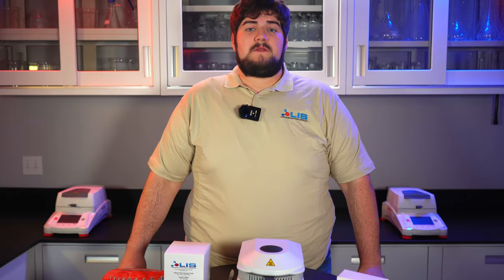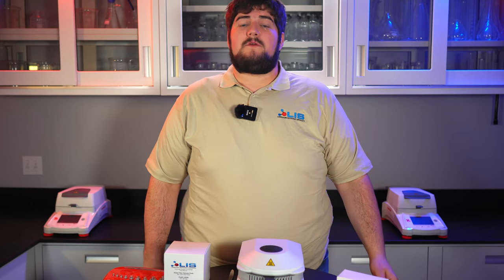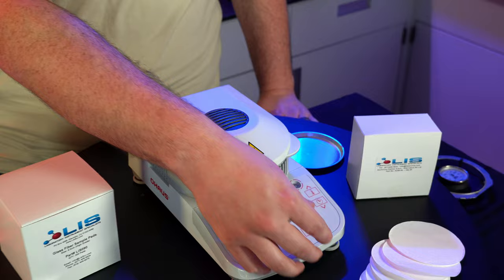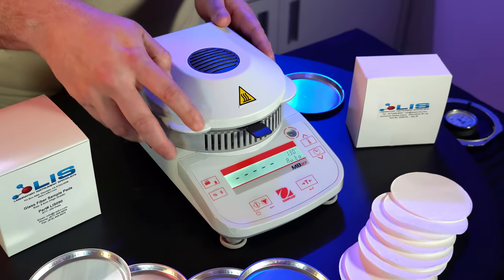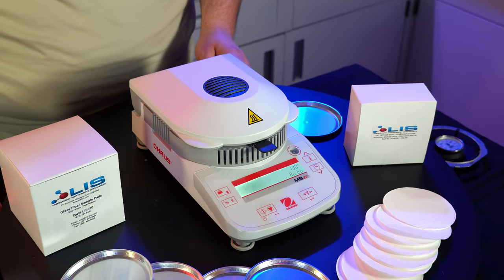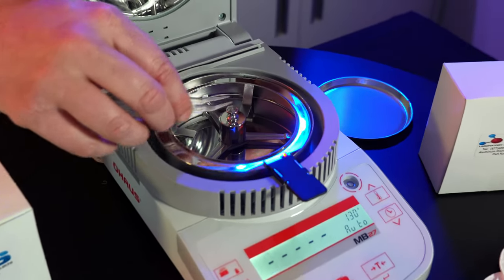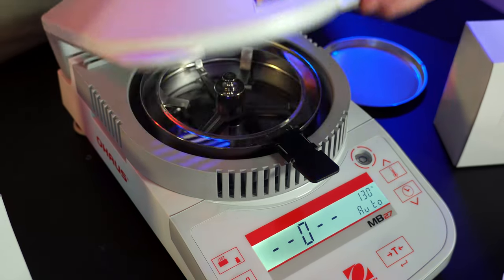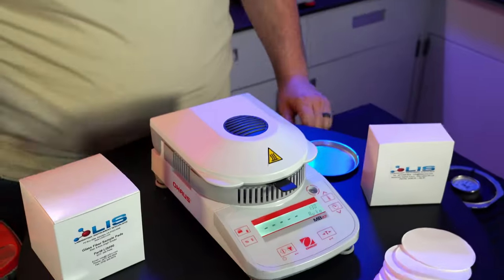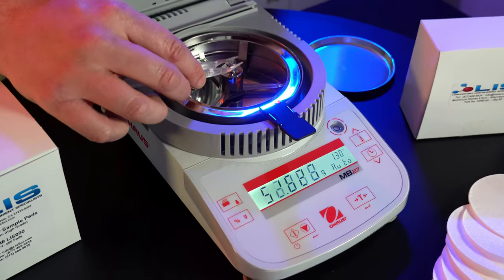To properly calibrate the instrument, you will need a precise calibration weight and a temperature calibrator like we have here. Both items are sold on our website. The MB-27 is very simple to calibrate. Open the lid and remove the aluminum dish. Press the tear button to zero out the scale weight. Press and hold the print button, which also acts as the calibration button. Once it reads cal, let go of the button and it will flash 50 grams. Take the 50 gram weight and apply it. Dashes will flash and when the number zero flashes, remove the weight and the screen will read done. To validate that calibration is correct, place the 50 gram weight back onto the scale and it should read 50 grams.